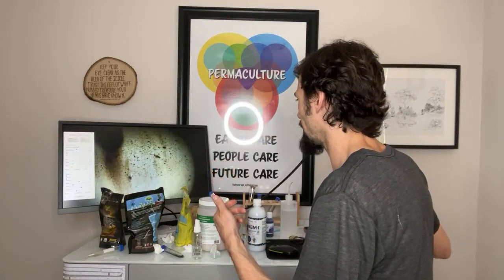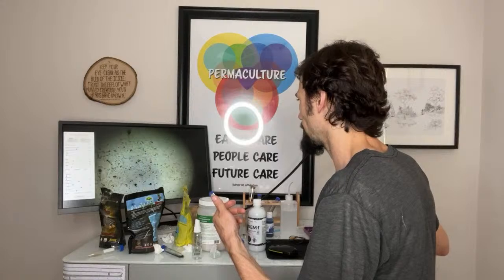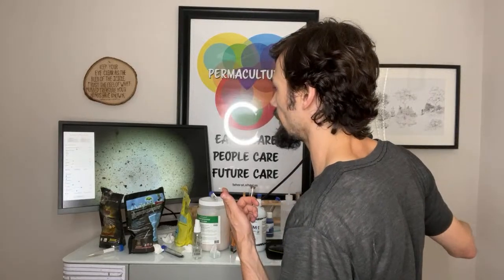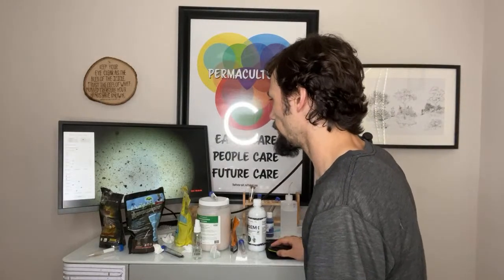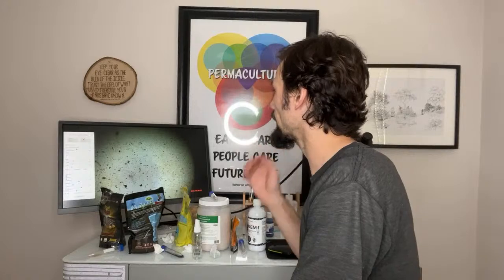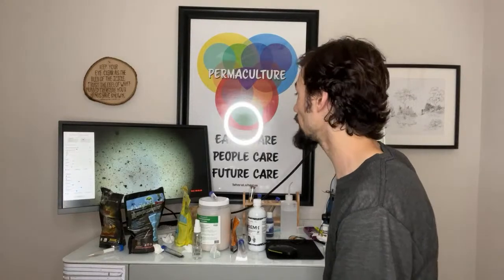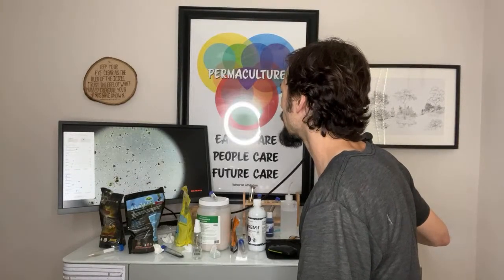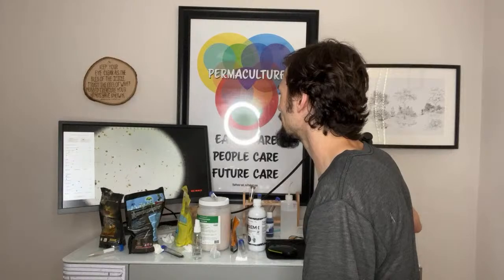Again, that was super fast, but let's just pick our area to zoom in on where it's not too intense. So you can see the rods there are not alive, like instantly. Like there's a rod right there and it's instantly clear. Let me start recording. For the azos, they've got some crystalline shapes here, sand and clay essentially mixed in. So let's zoom in closer, let's find that rod. Yeah, it's a very straight crystalline rod.